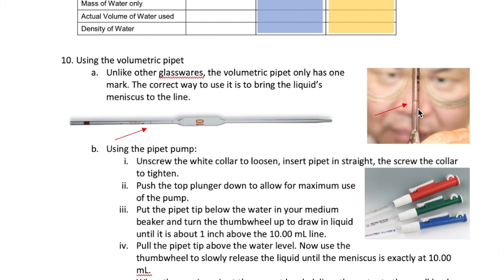To get water into the pipette, you're going to use a pipette pump, shown here in various colors. First, unscrew the collar of the pipette pump counterclockwise. Then insert the pipette into the collar and turn it clockwise to lock it. The pipette is now securely inside the pump and there's a tight seal that ensures the volume will be delivered correctly.